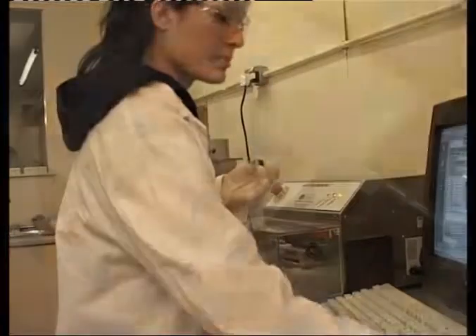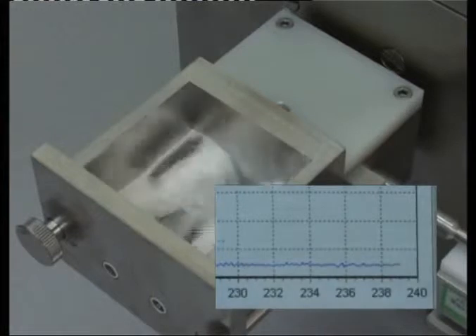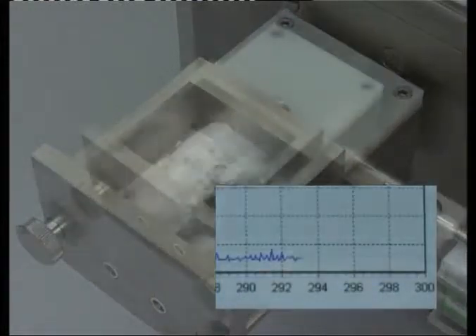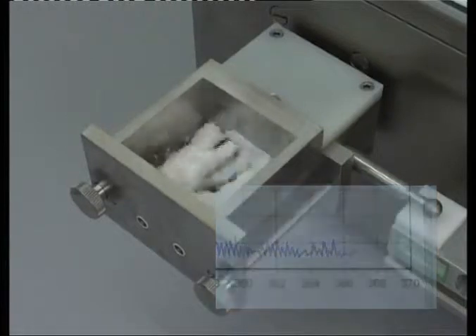The MTR offers the ability to observe the subtle differences in the rheological behavior of wet granulation caused by varying the binder solution concentration, type, and the binder-powder ratio.